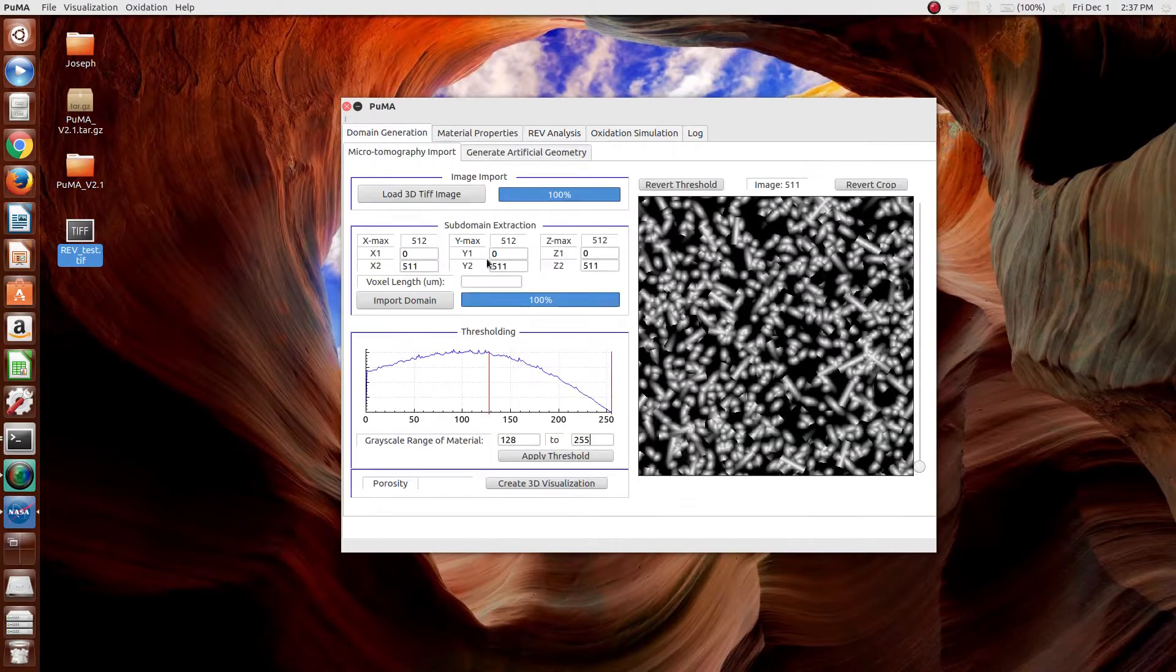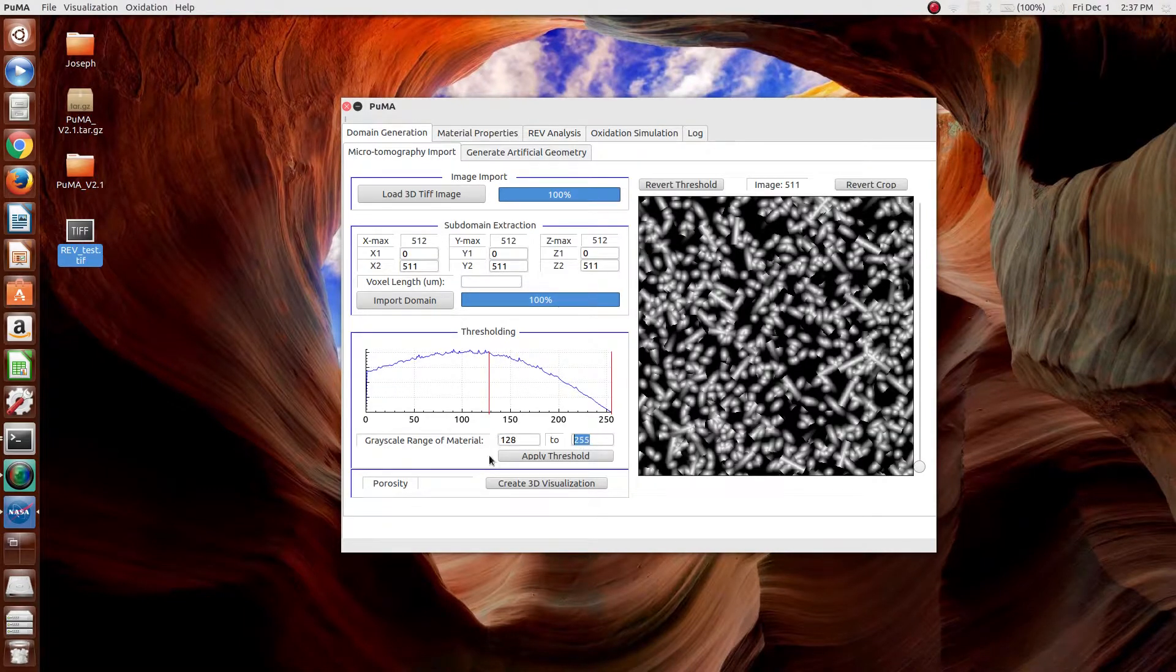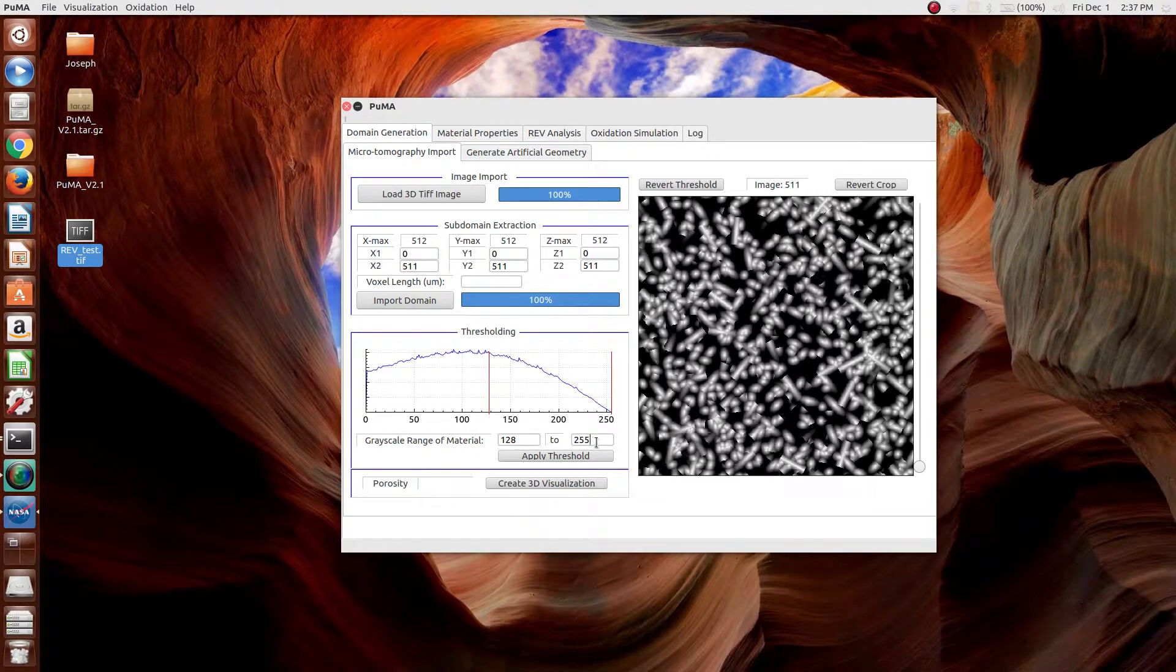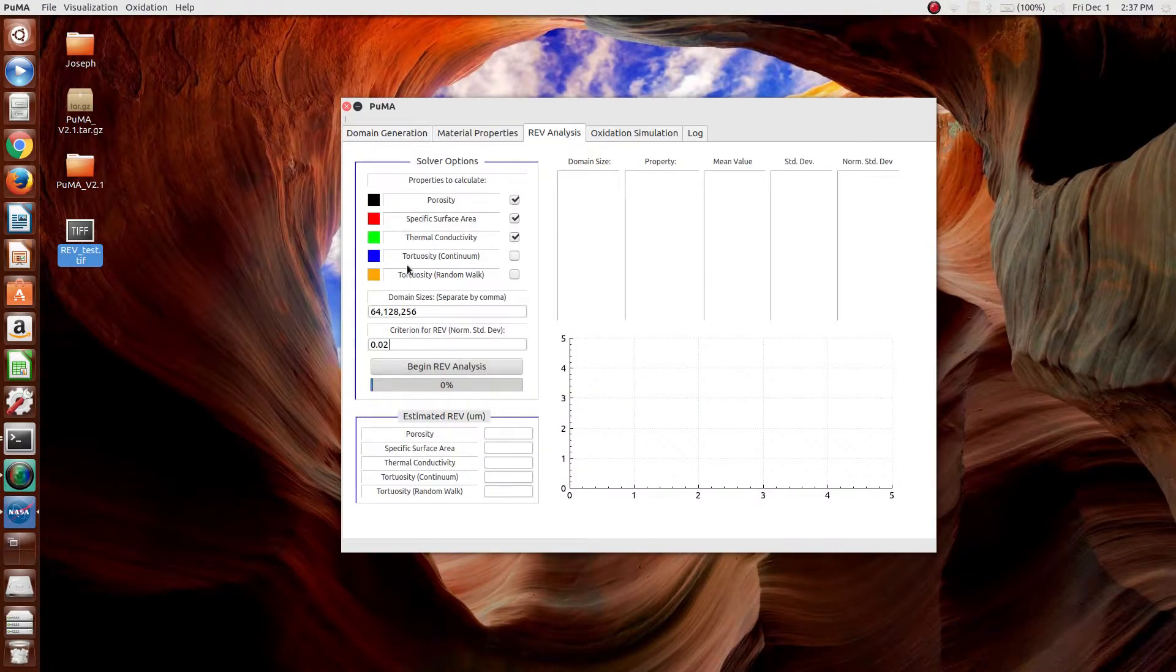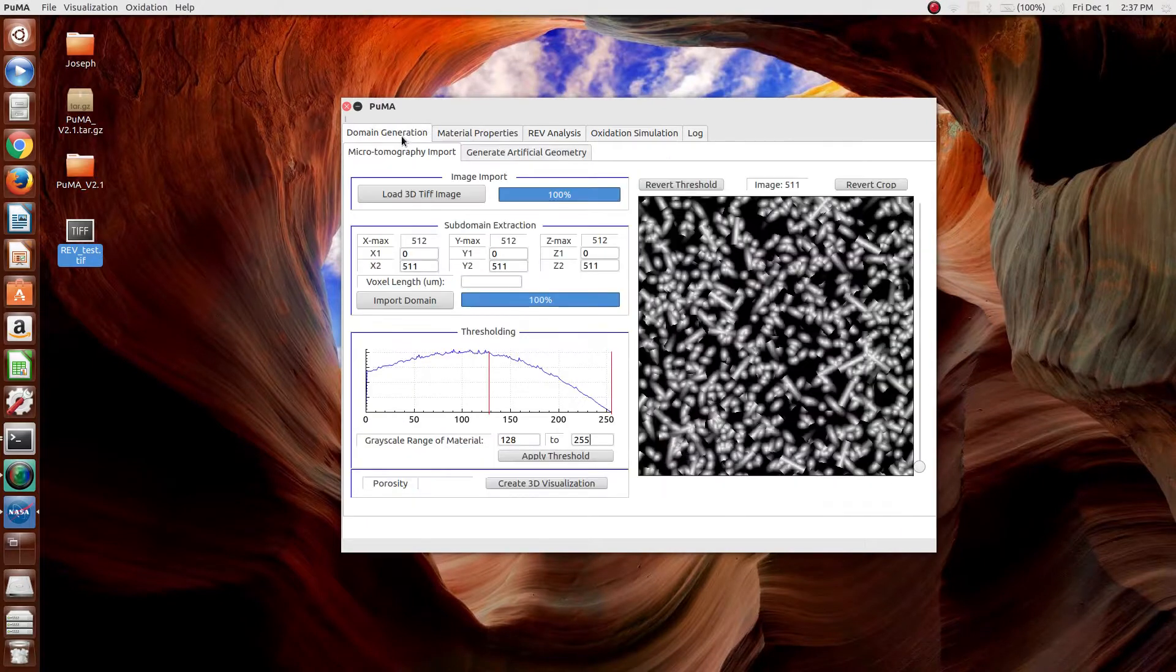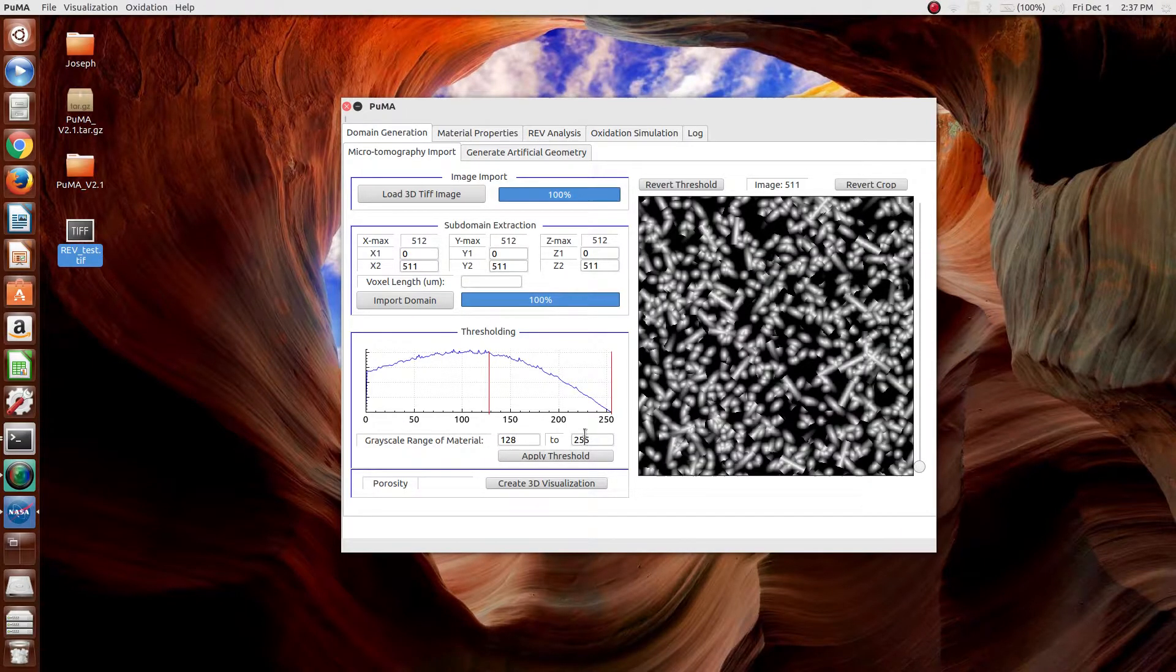So, the input for the porosity is the grayscale range of the material. In this case, both of the values have to be specified. For the specific surface area, the requirement is also just the grayscale range of the material.